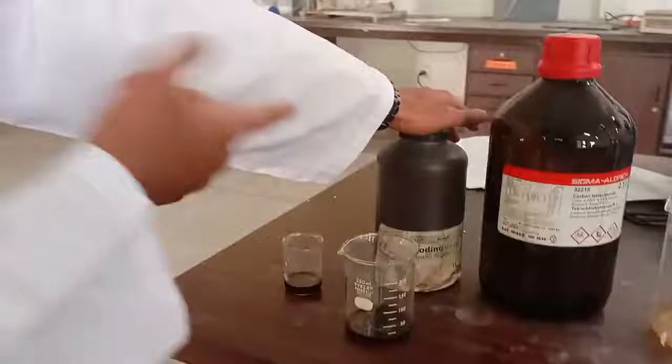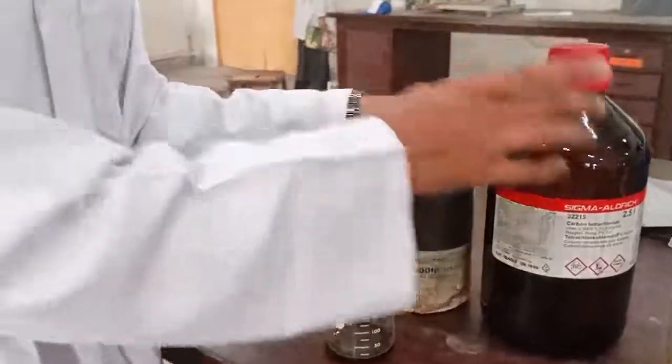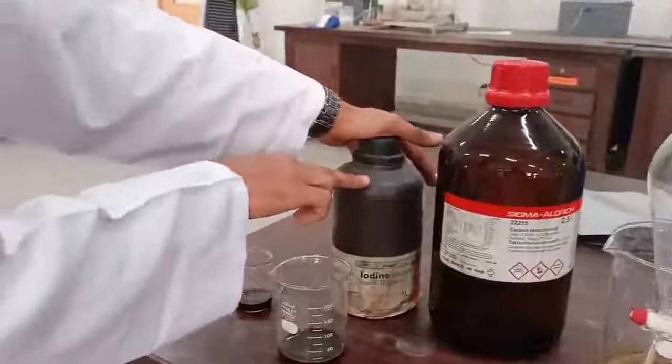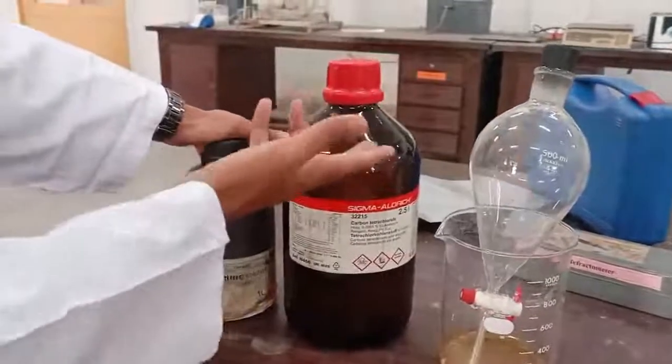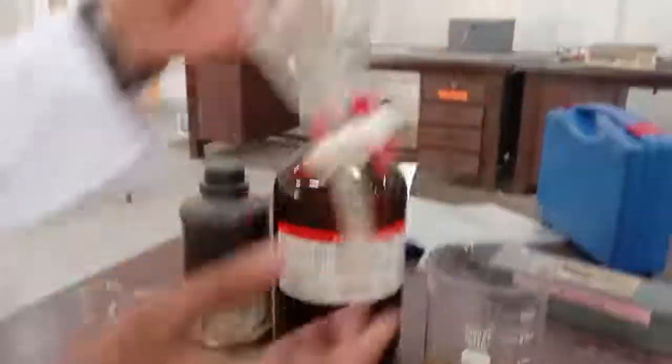You take this 5% iodine solution and you have to take 30% of it as the volume of CCl4. For example, if you take 100 ml of iodine solution, you have to take 30 ml of carbon tetrachloride. We then mix both of them together in the separating funnel.